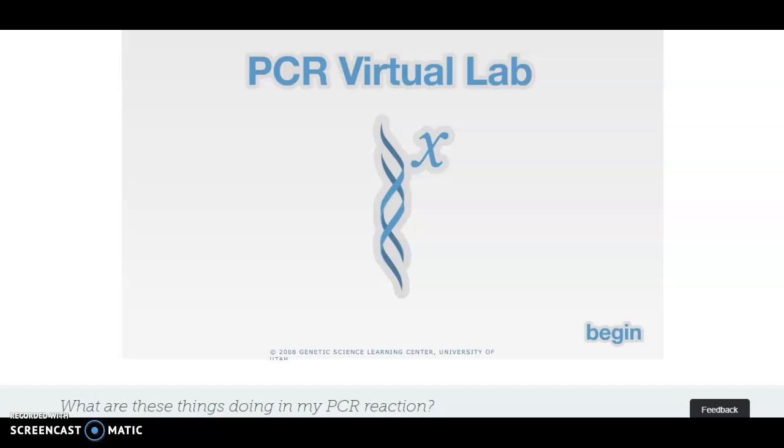I'm going to be going over some PCR stuff with you guys today. It's a PCR Virtual Lab. It is brought to us by the University of Utah Learn Genetics. I will make sure you guys have all the links associated in your class Teams pages.